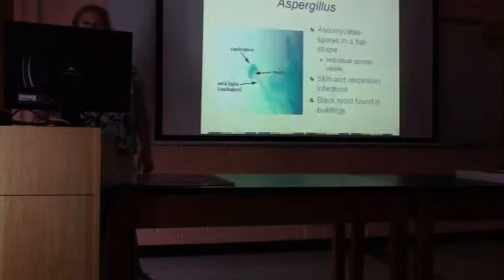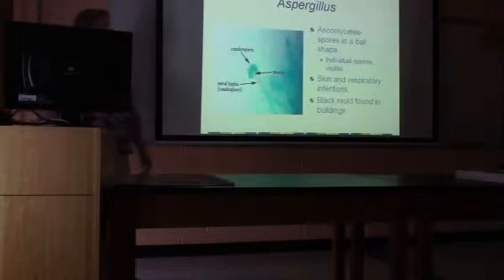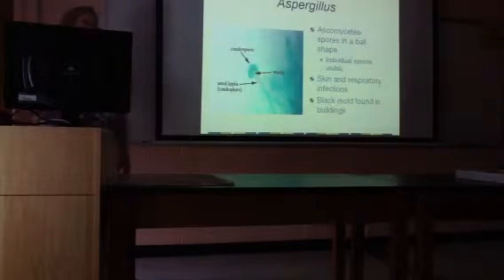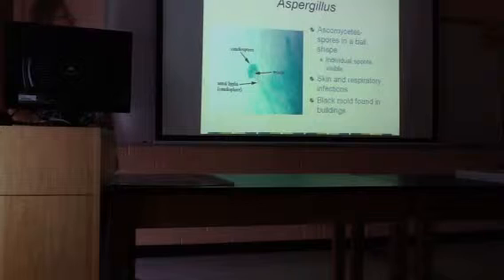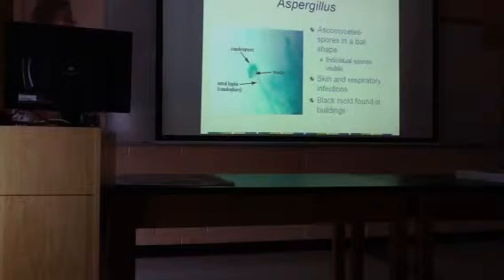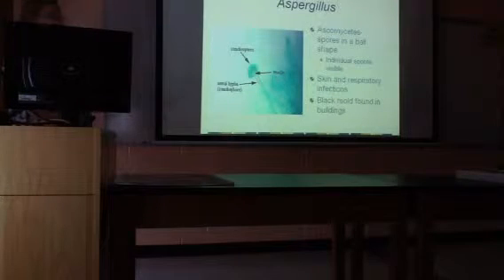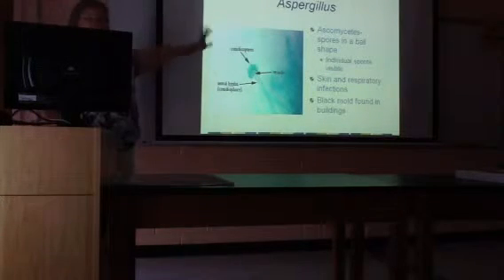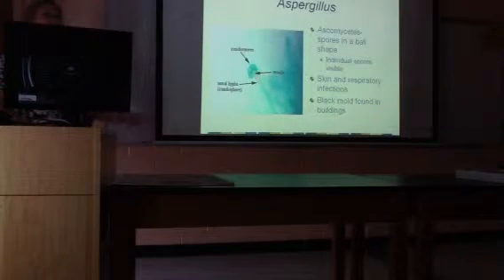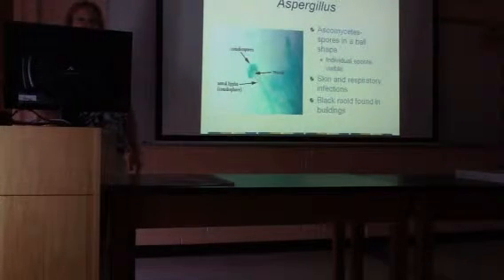So what we're going to do now is the same thing we did last time. We're on the materials page of Lab 3, which I believe is around page 17, if you want to go over that. We're going to go through all of the slides that you need to look at today, so I'm giving you some hints on how to identify them. And also, if there are any diseases they cause, that's typed out to the right, which of course is all potentially fair game for this Wednesday.